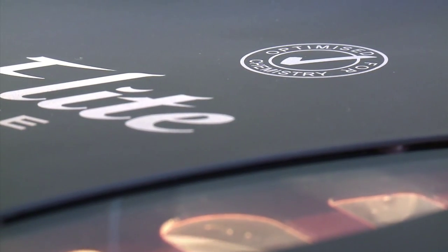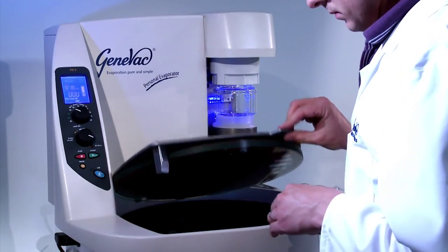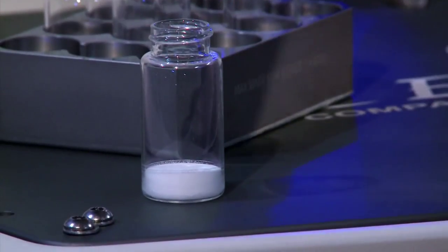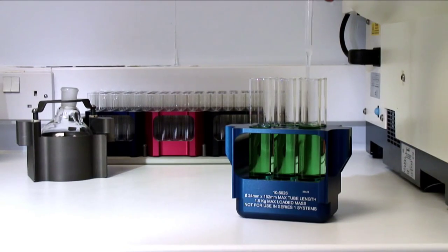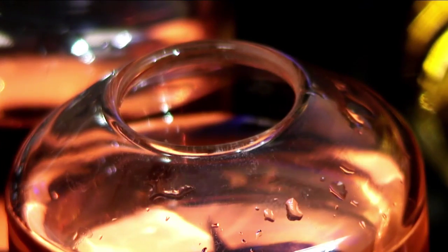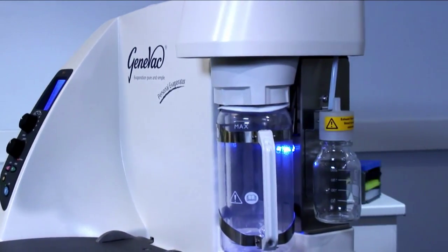The LyoSpeed method evaporates the volatile organic solvents in the HPLC fractions, then concentrates some of the water, only lyophilizing the last few milliliters. This is much faster than traditional freeze drying, and the EZ2 overcomes any risk of solvent bumping. If you need to concentrate rather than dry your samples, then the standard methods can be optimized by your local Genevac representative. In some cases, the addition of a solvent keep is necessary to ensure that the samples remain wet. The evaporation method is set to evaporate the more volatile solvent, leaving the keep solvent behind.